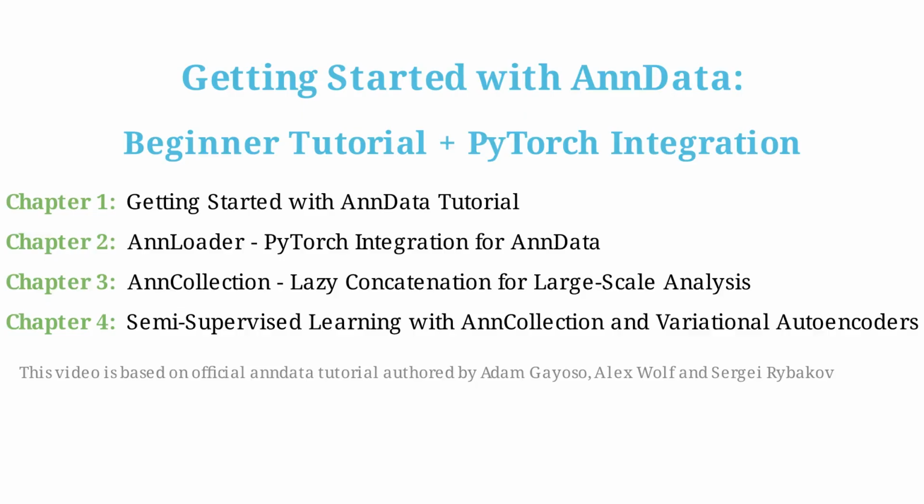This video is based on the official Anndata tutorial authored by Adam Gayoso, Alex Wolf, and Sergey Rybakov, but with more in-depth analysis, visualization, and my personal takes.